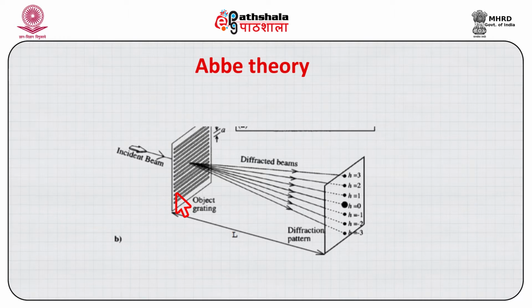If a is significantly larger than lambda, then the diffracted beam will be too close to the direct beam to be seen, and therefore the two should be nearly similar. The spacing in the diffraction pattern is reciprocally related, as I stated, and the diffraction pattern is normal to the line of grating or periodically spaced object. This leads us to the concept of reciprocal lattice.